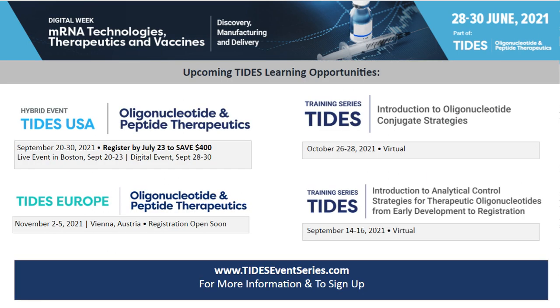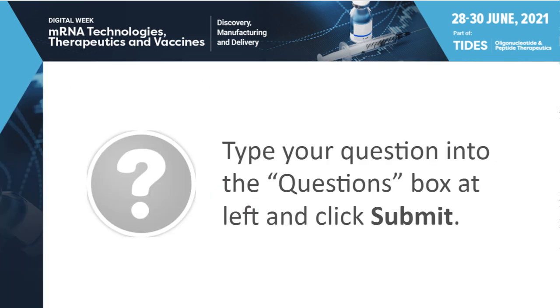Jordana, as I said, we do have quite a number of questions in, so I'm going to try to read them out. Let's see if we can get through as many of these as possible in the time that we have left. First question I have is, does Cap1 capping make mRNA less immunogenic and consequently less susceptible to degradation?